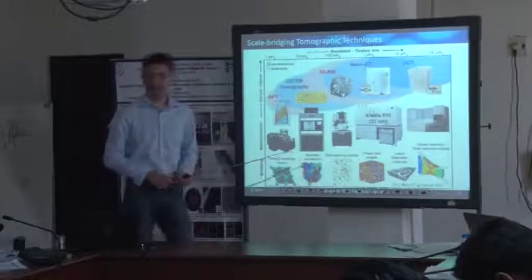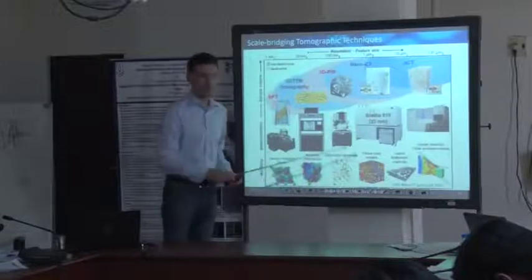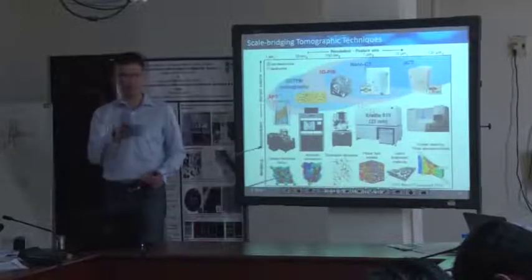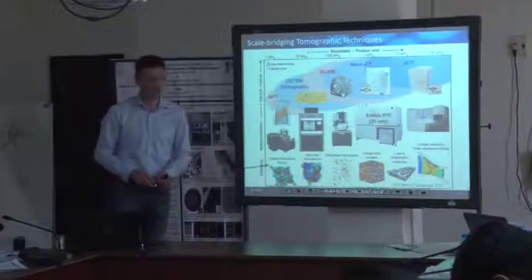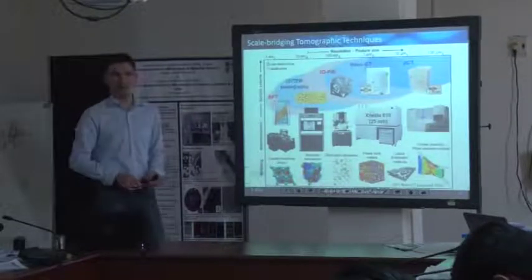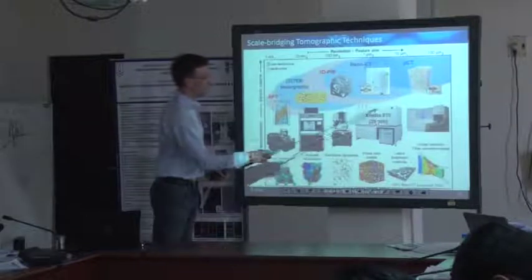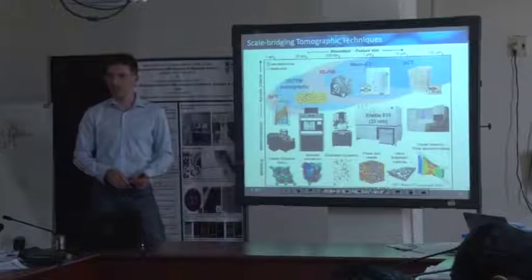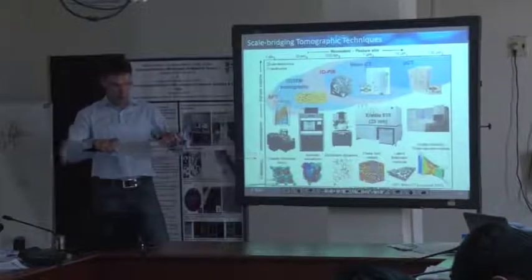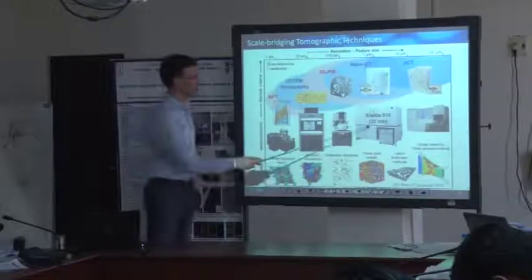For some of the people who work on nanoparticulate materials or nanomaterials, 25 nanometers is somehow limiting, isn't it? On the other hand, the sample size for such tools is of the order of, let's say, 10 micrometers to 50 micrometers or so. This is the object size.